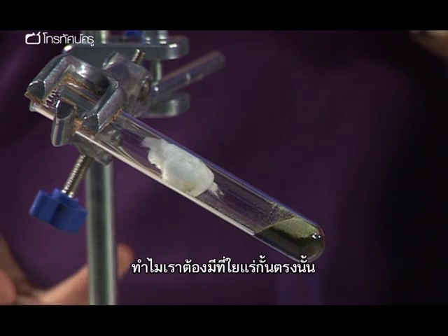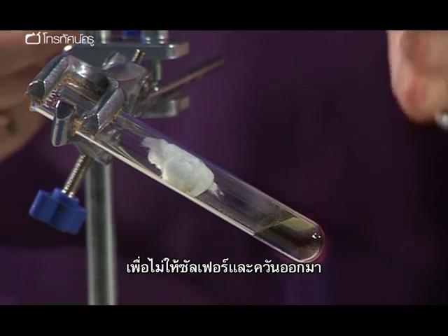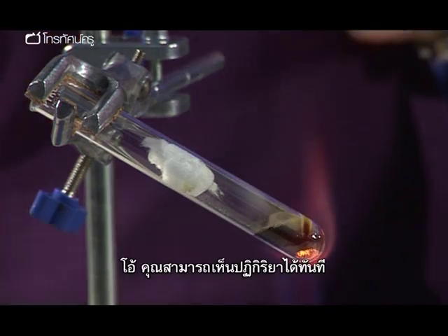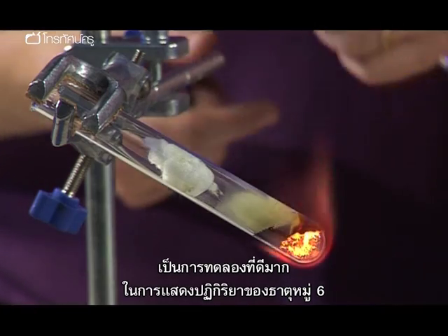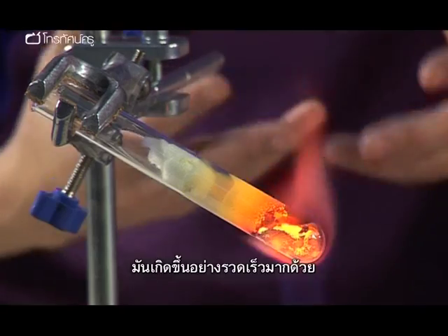Now why do we have the wool there? This is just to stop the sulfur coming out and the sulfur fumes. And oh gosh, you can see it happen already. It's a nice reaction to show the reaction of group 6. And it happens really quickly as well.